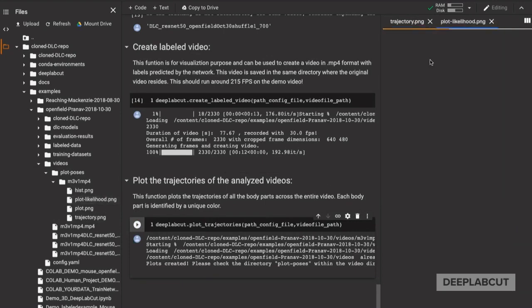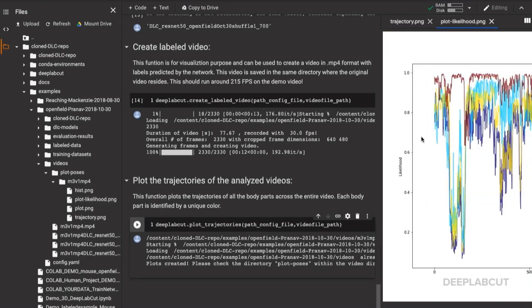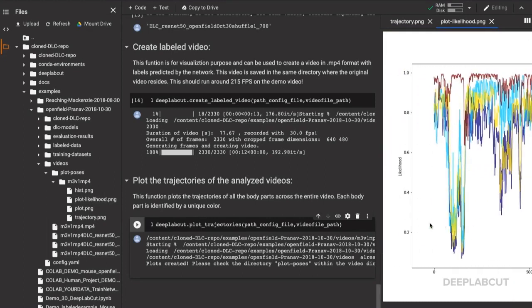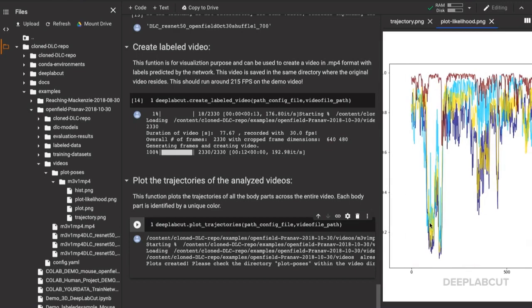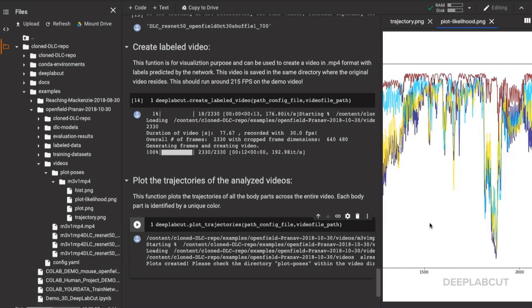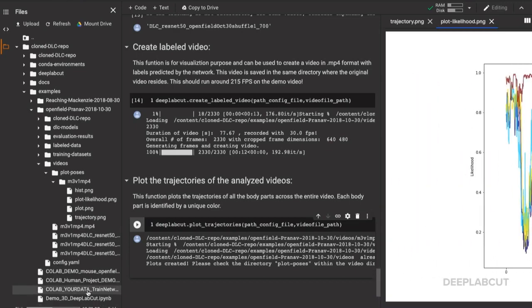By running plot trajectories, you can also look at some of the outputs of the network on the video. For example, you can look at the likelihoods to determine what an appropriate P-cutoff might actually be, as well as getting a general sense of the data by looking at the trajectory or the plot PNGs.